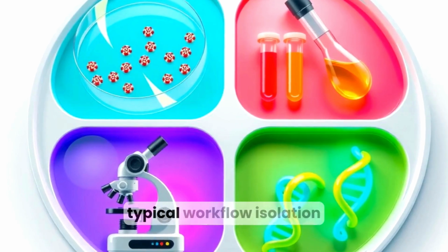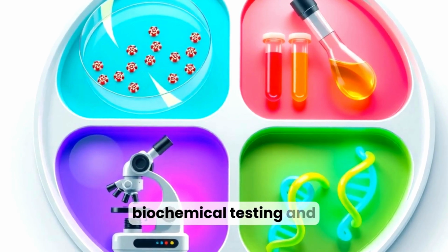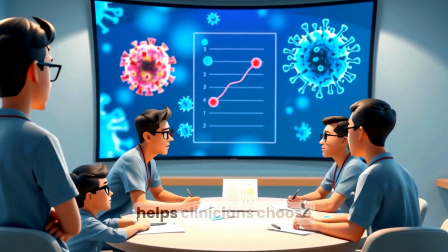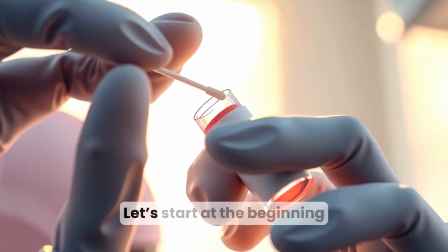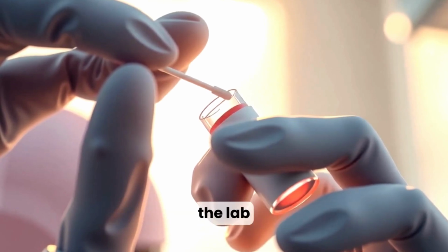Today we'll break down the typical workflow: isolation, microscopy and staining, biochemical testing, and molecular identification. Understanding these steps helps clinicians choose effective treatment and helps public health teams control outbreaks quickly. Let's start at the beginning: how samples are collected and how isolates are obtained in the lab.